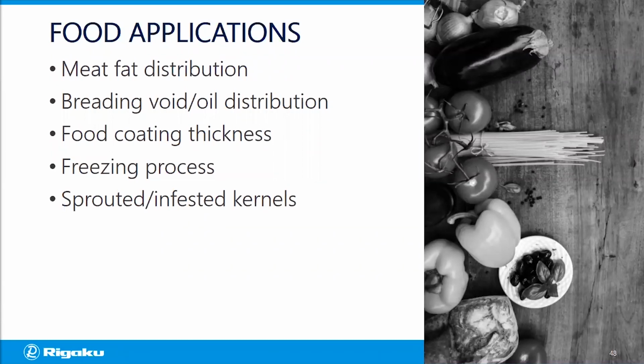Another thing that people use the CT technique for in this industry is the classification or identification of phenotypes. Since X-ray CT is a non-destructive 3D imaging technique, you can use it to look at seeds, grains, fruits, or all different kinds of plants in 3D. And that is a convenient way to classify or identify phenotypes. So that's one of the applications.